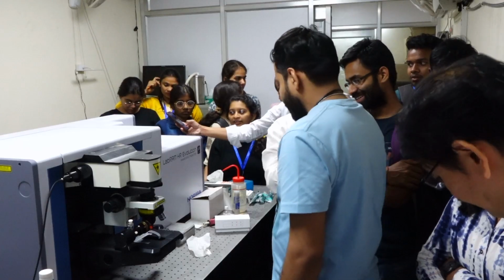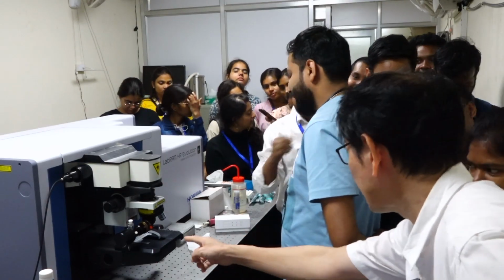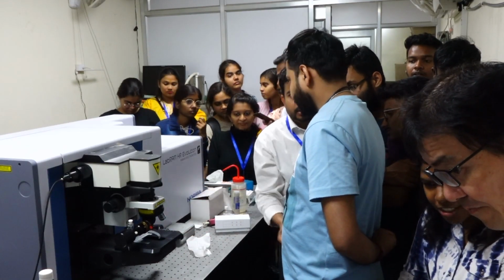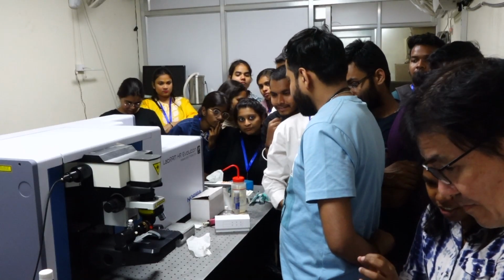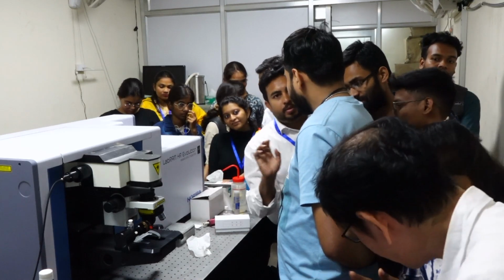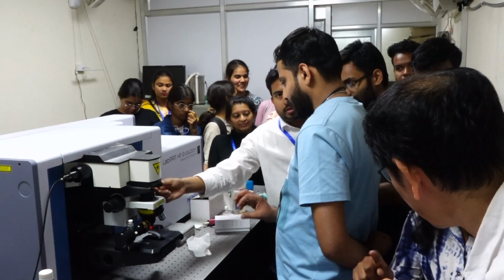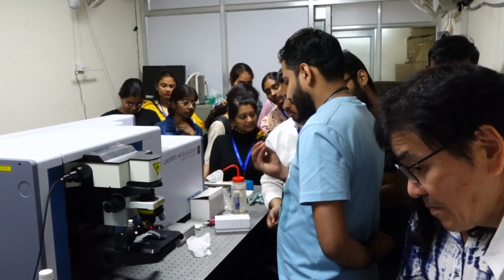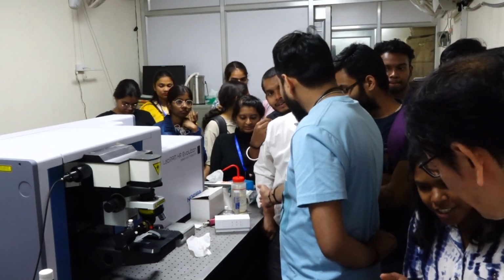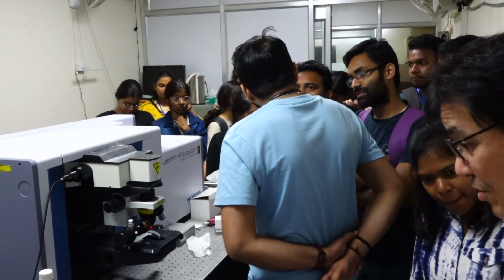Sir, how do we know the sample is well focused? In this case, focus on the chip. Here we can see the sample, and the laser light is in focus. For a solid sample on a glass slide, we have to focus the laser light onto the sample, and from here we can also see whether the sample is focused or not. There is a button to show the visible image.